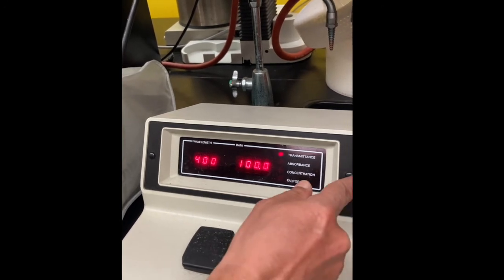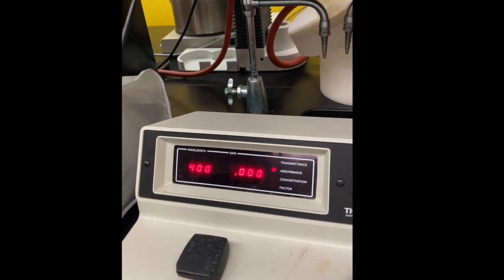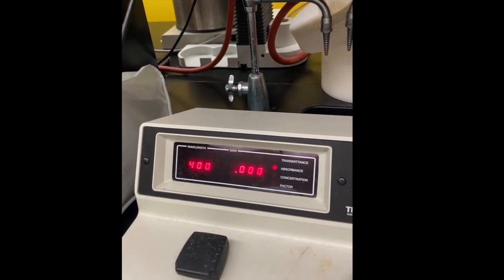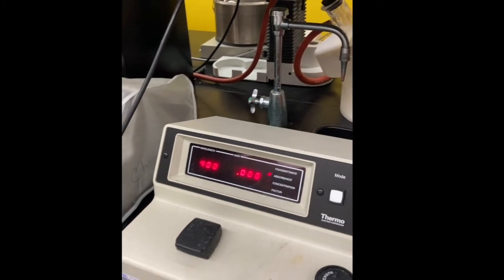Or if we are in absorbance mode, it needs to be set to 0. So now our spectrometer is ready.